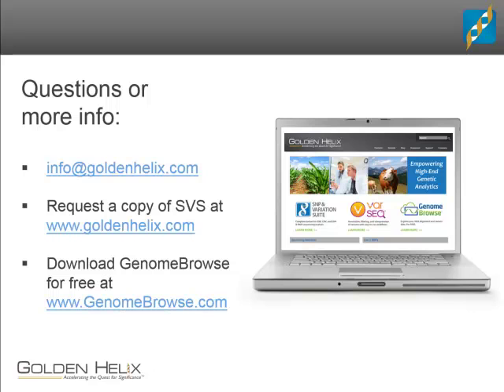Typically, though, you would expect that several of them should be followed up on, and you can always look up the annotations for all of the variants, determine the population frequency for all of them and other functional bits of data.